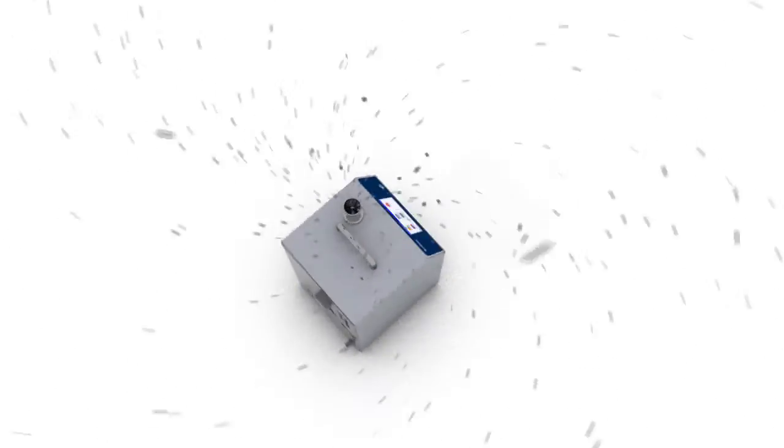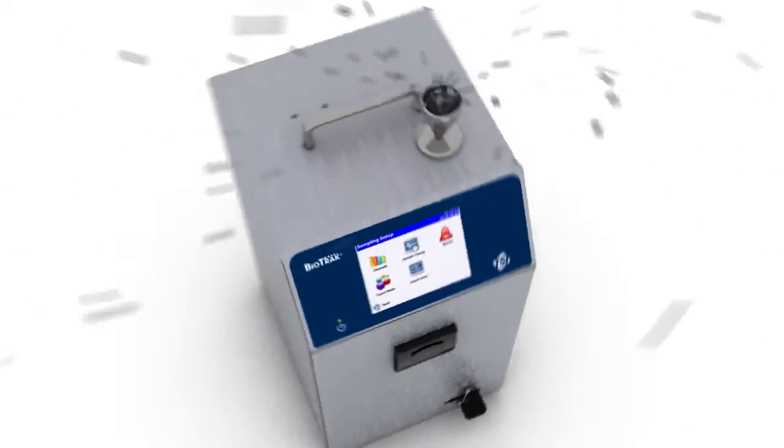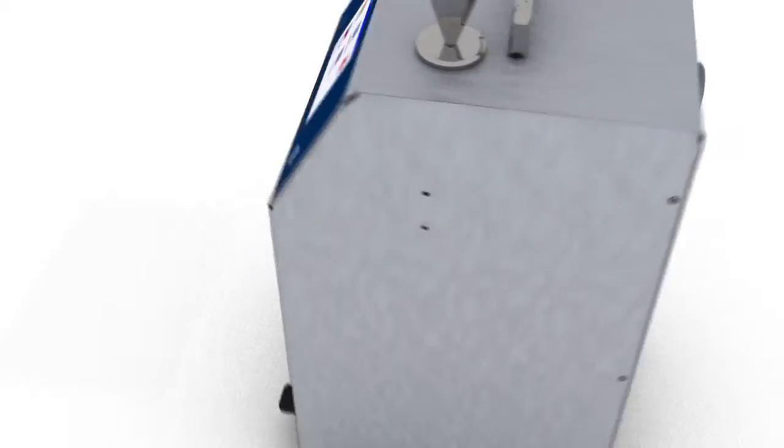Biotrek, the real-time viable particle counter that delivers data you can trust, moving you towards real-time quality assurance and process control.